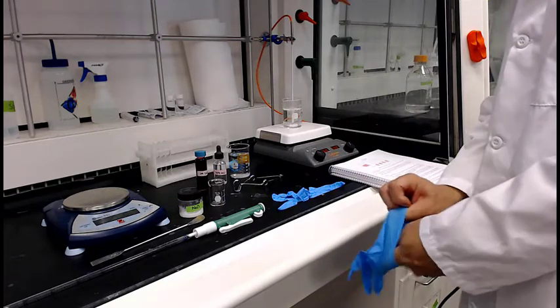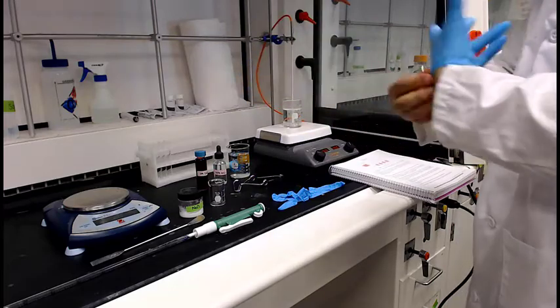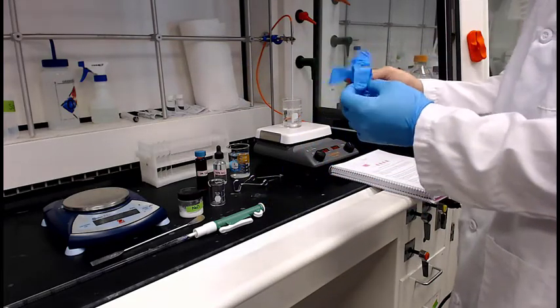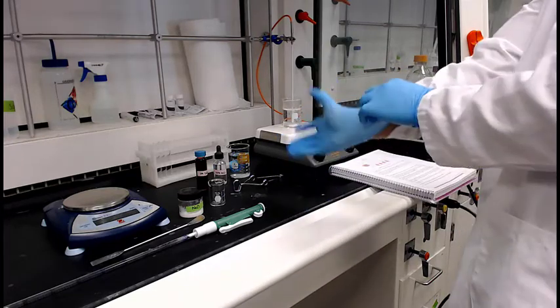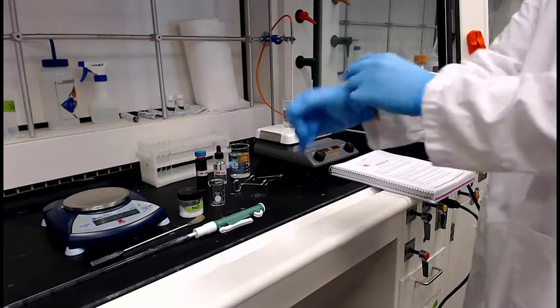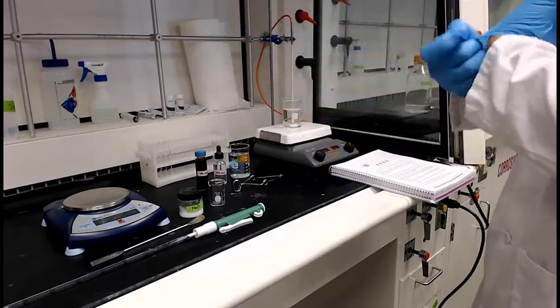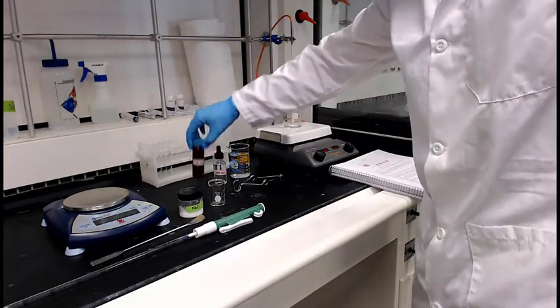And then right beside that, it's a little hard to see, but that's an ice bath. We got some of those colored plastic reusable ice cubes, so they're already in the water. So that's a cold bath that's sitting on this side of the hot plate. So away we go. We should, again, prepare the boiling water bath and prepare an ice bath. That's part B, step 1 done.